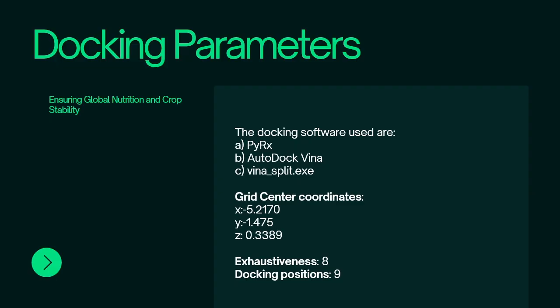Next are the docking parameters. The software that I utilized during docking were PyRx, AutoDock Vina, and Vina Split exe. After placing my important files where I needed them, I went forward and prepared a grid center, adjusting a grid over my protein, and I marked the coordinates.